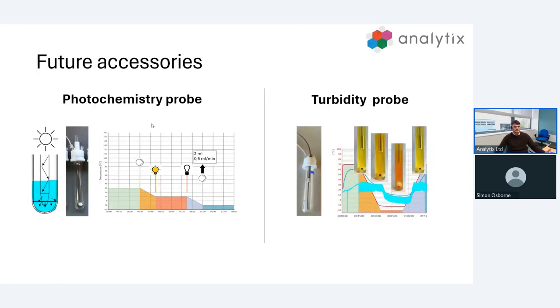A big focus of Labtech is that they want to continuously release new accessories opening the door for new applications. Some applications that are under work now primarily include our photochemistry probe. This should be programmable with the software and we'll be able to measure this during the reaction, as well as a turbidity probe that you can see on the right. These should be coming in the next few months and hopefully make a big application difference.